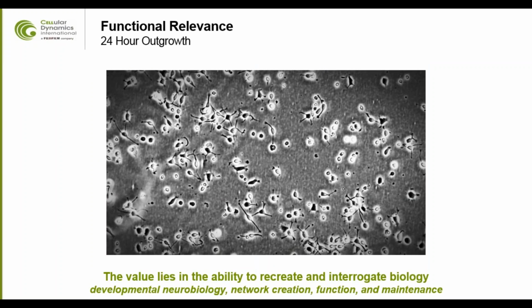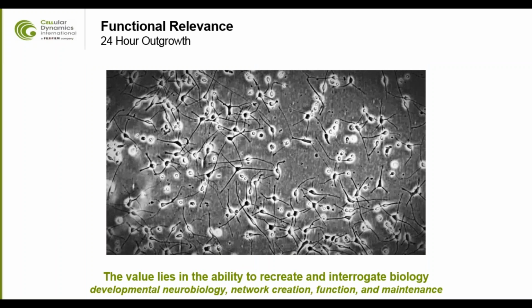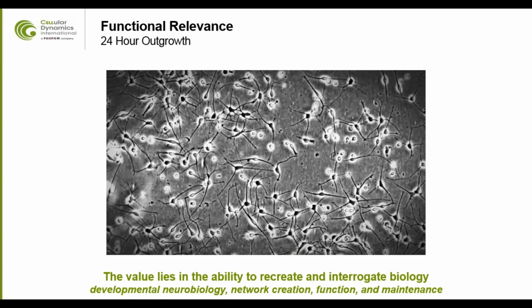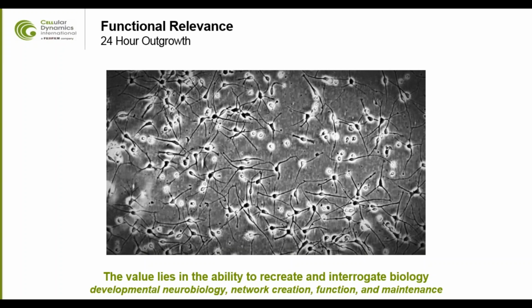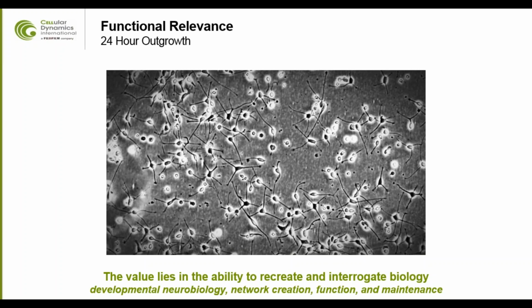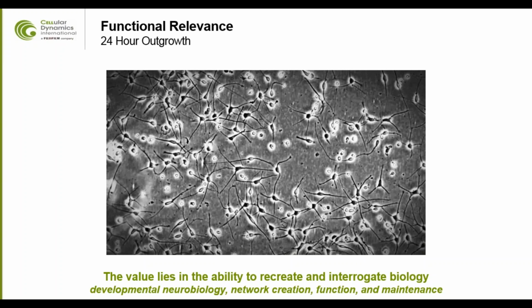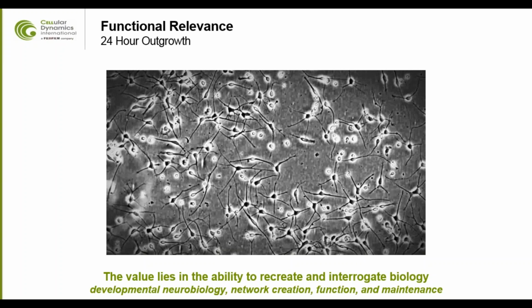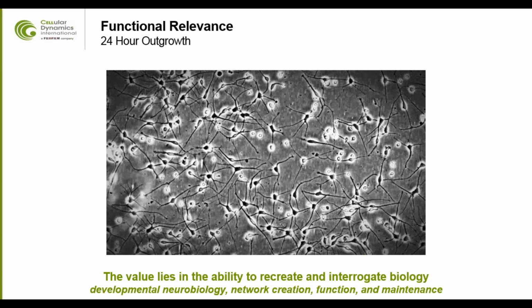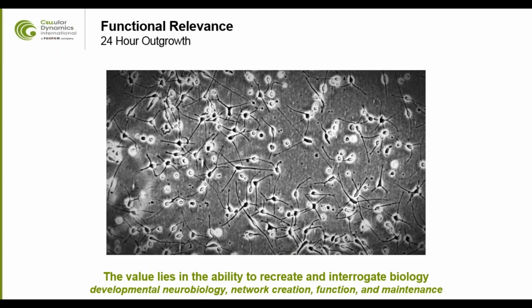All right, the power of the iPSCs, as you can see, maybe somewhat choppy with this movie, is the recapitulation of that relevant cellular behavior. So in the case of neurons, what we see is the neurons settle down, adhere to the bottom of the dish, and then branch out, spread out their processes, seeking out the correct partners, partnering with those other cell types, and as we'll see later, beginning to communicate with those other cell types, right? And what this allows us is to recreate the biology, but more importantly, to interrogate that biology.